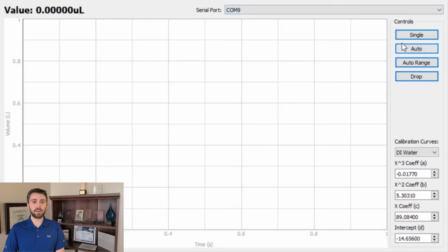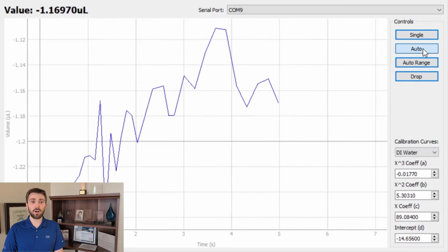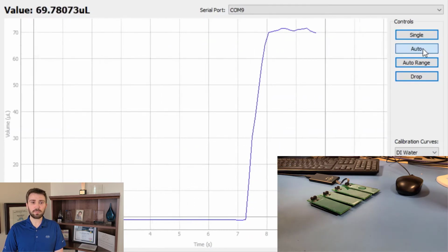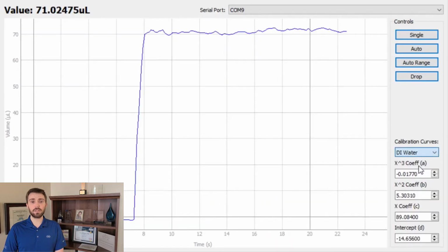The GUI is provided as part of our delivered product. Now, with our device connected, we can power up the GUI and connect to the Binho Nova through the COM ports. You can either take single samples or let the computer automatically take samples for you. As you can see, the GUI will show a response and measure the volume applied live. As the program currently stands, it will support future work by making calibration curves modular and easy to select. The program uses a CSV input file and makes adding and editing curves a breeze for follow-up work.